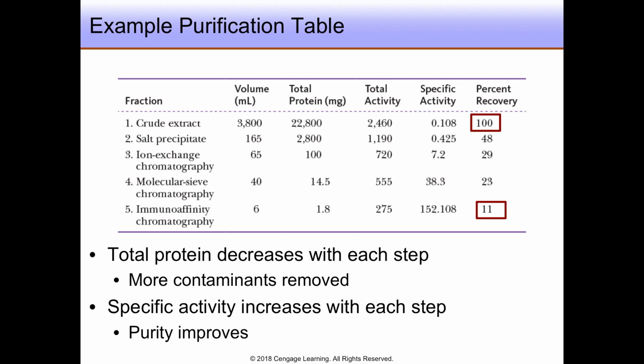Protein purification by these methods can be a very laborious process, albeit successful in obtaining a pure sample. Purity of the sample is essential to the accuracy of the data obtained from our studies of the protein's structure and function.